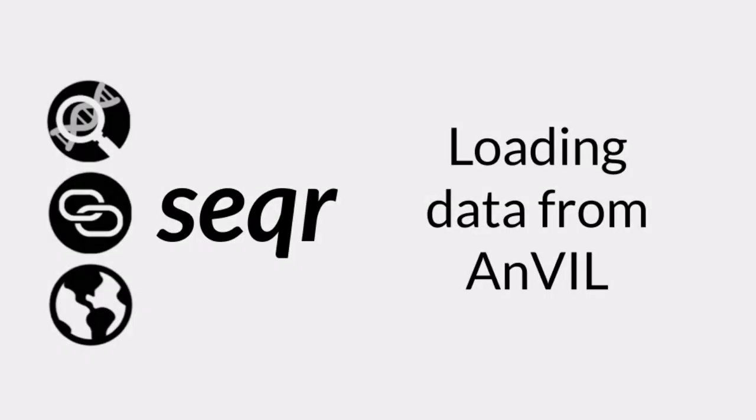I'm a technical lead on Seqr, and today I'm going to walk you through how to load your data from an AnVIL workspace into Seqr.